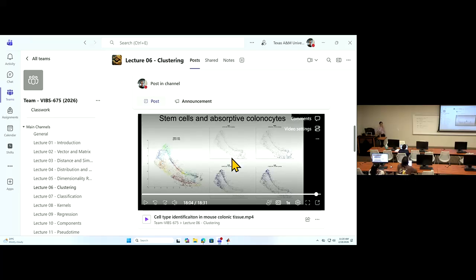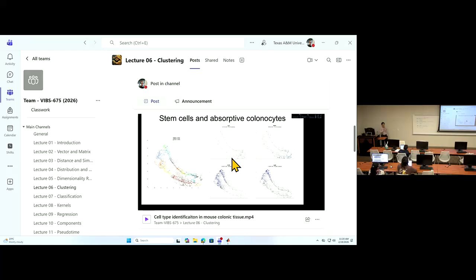Yeah, so this is how manual cell type annotation should work. You have to be very familiar with the system, so you know what cell types you expect to see. And you'll be able to have this picture in your mind, the marker genes for each cell type.